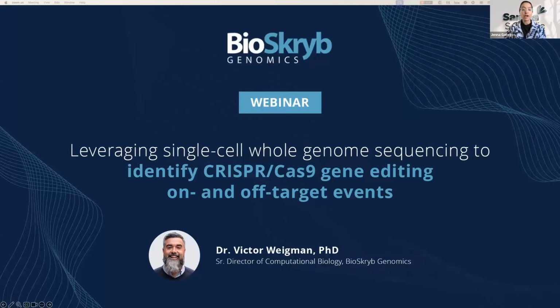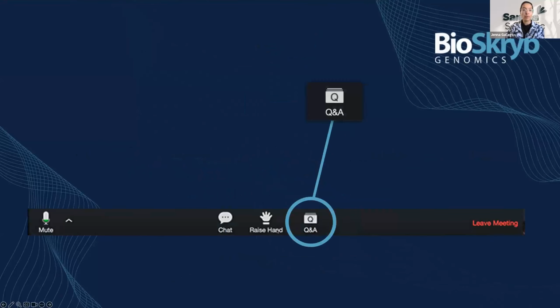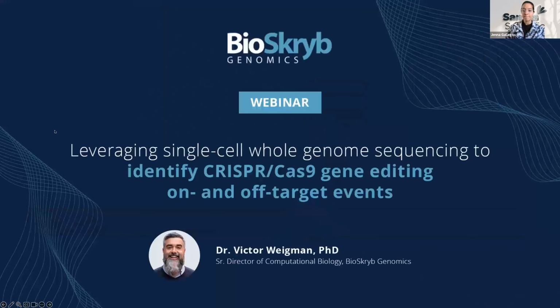In this webinar, Dr. Victor Weigman from BioSkryb is going to present data on using primary template-directed amplification to perform single-cell whole genome sequencing to identify on and off-target events in individual cells that occur following CRISPR-Cas9 gene editing. Without any further delay, I will hand it over to Vic.